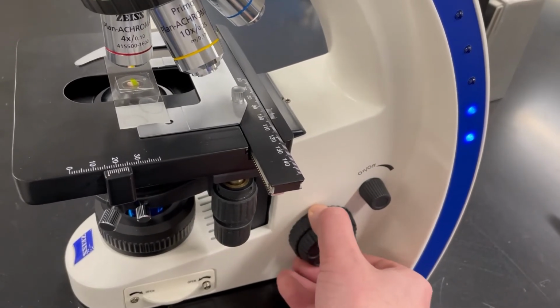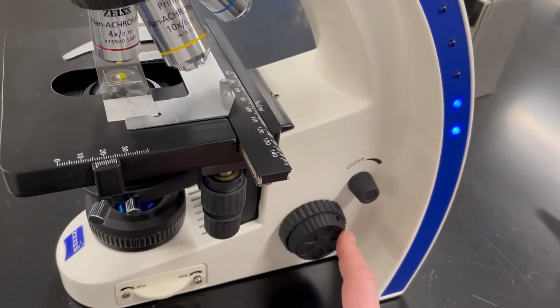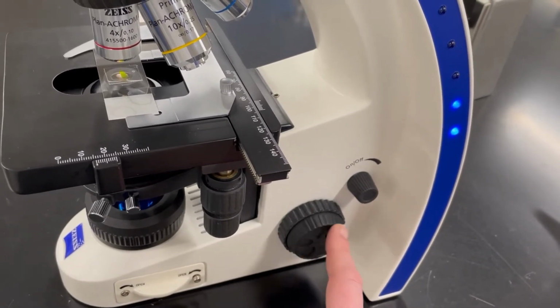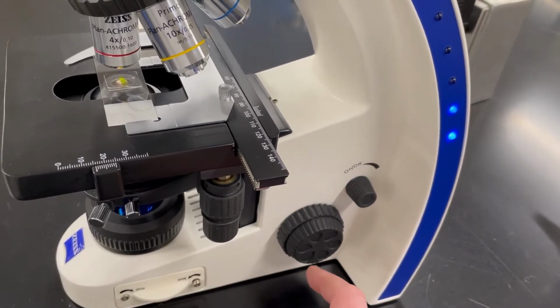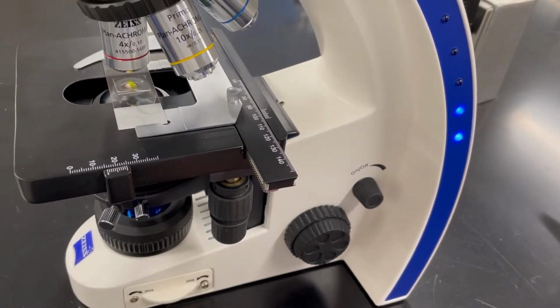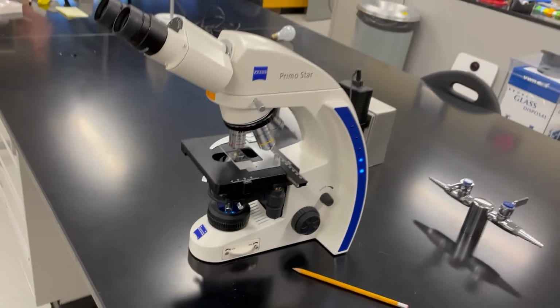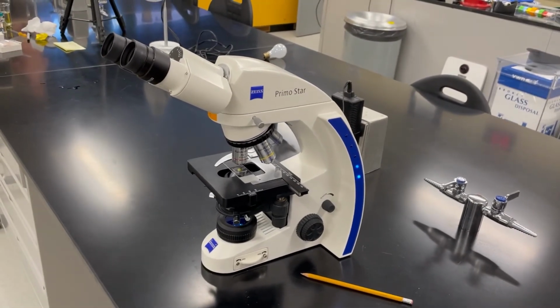Then once you're almost focused, you're going to move the inside knob here, which is the fine focus, and that also moves the stage up and down, but just at a very small degree so that you can focus on everything a little bit sharper. So that is the PrimoStar microscope.